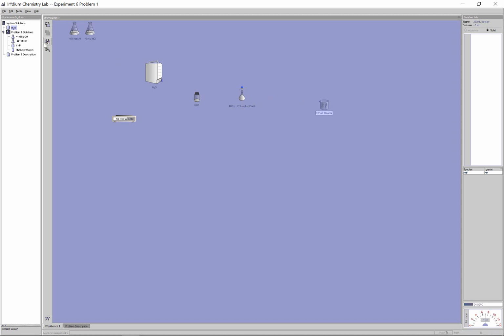Usually you can take a graduated cylinder here. So I'm going to pull out a graduated cylinder. I'm going to pull out a 25 ml grad cylinder. I'm going to sort of pre-fill it here. Let's pre-fill it with 25, sure. Okay. And I'm going to slowly take my graduated cylinder and I'm going to add it to my volumetric flask.